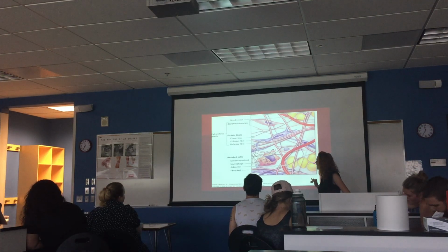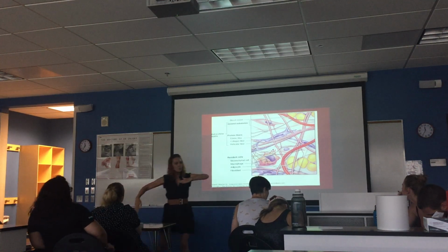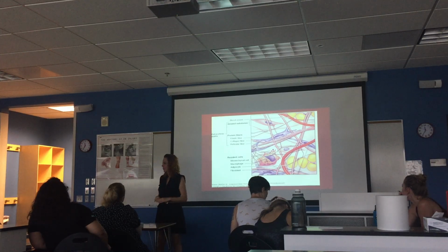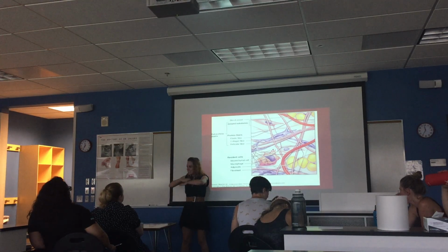So the structural plan for connective tissue is different than that of epithelial tissue. Remember, epithelial tissue is just cells, with a top and a bottom, right? Over here, this is connective tissue. We'll just look. It's not all cells.